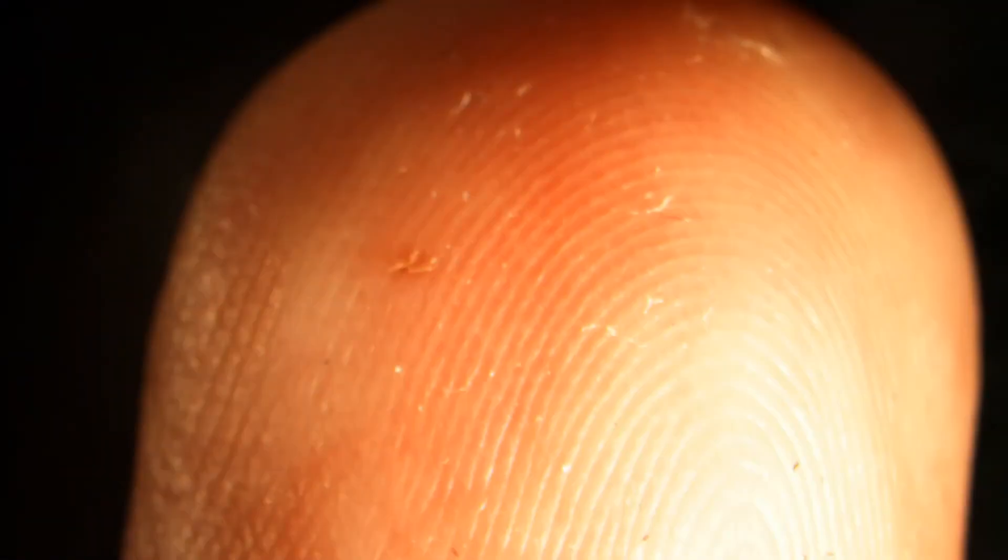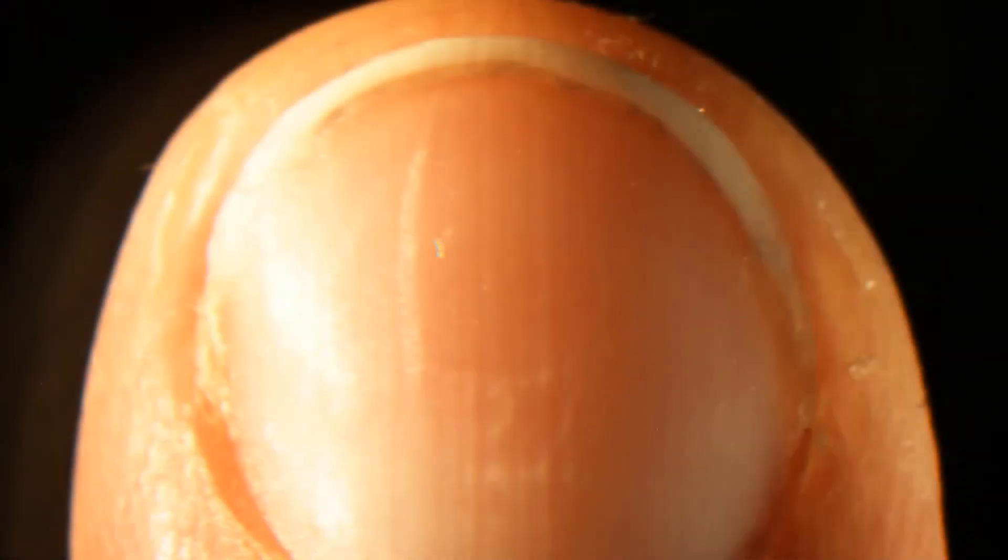Here is something that I put under a microscope. It's really zoomed in. Can you guess what it is? It's my fingerprint. Let's try some other ones. What do you think this is? It's my fingernail.